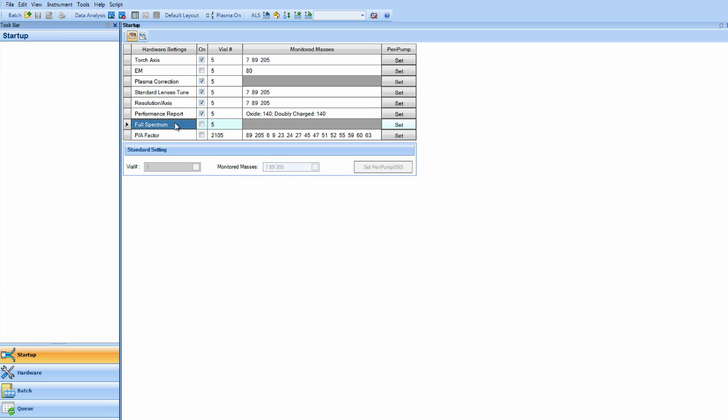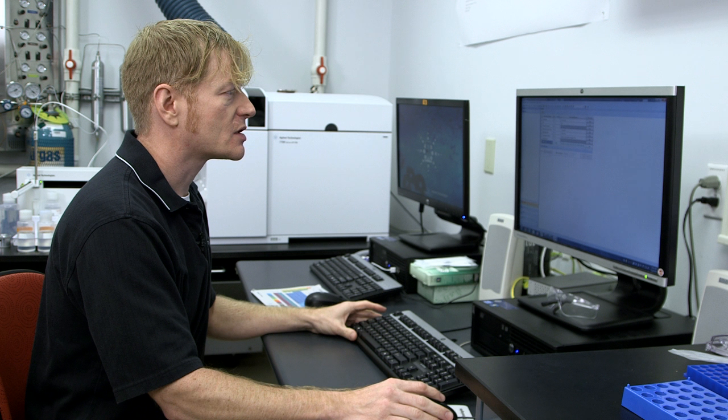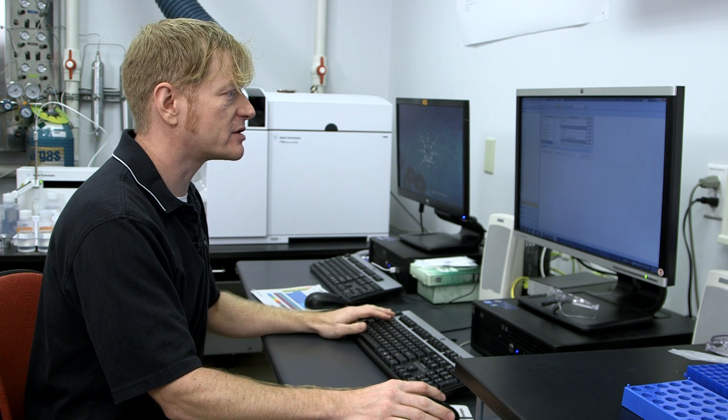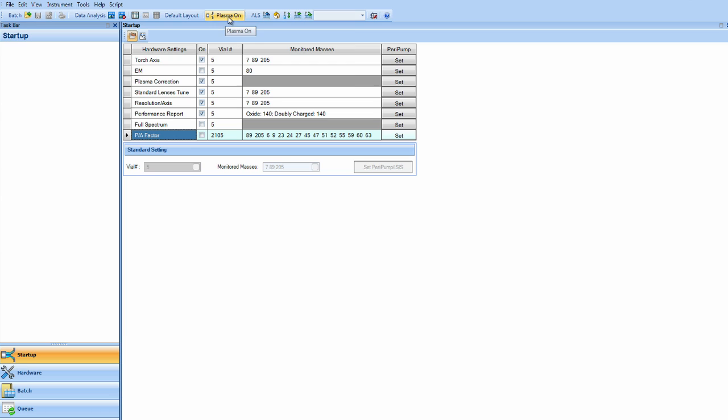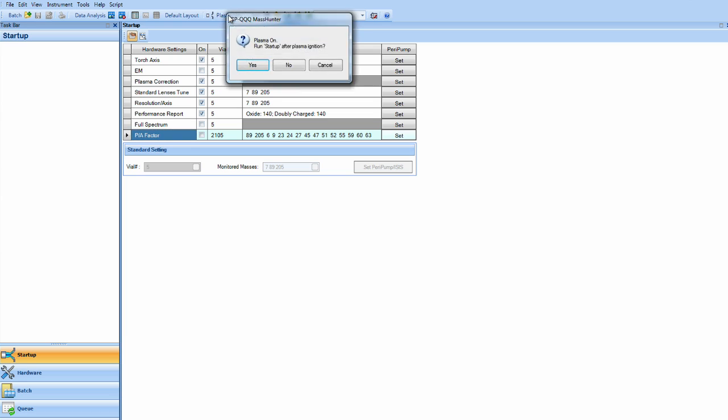Full spectrum, so you can analyze on startup a sample, and pulse analog factor, which keeps your linearity over nine orders of magnitude. So now we will turn the plasma on and go through the startup protocol.